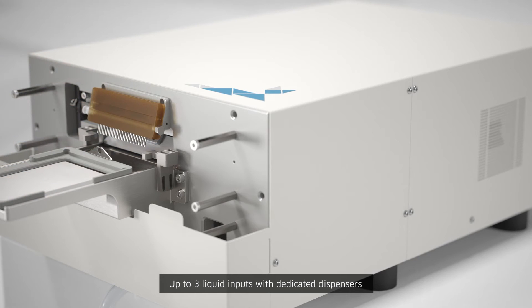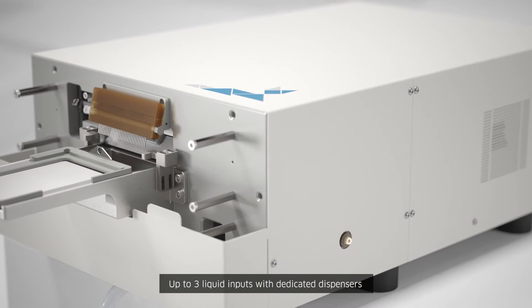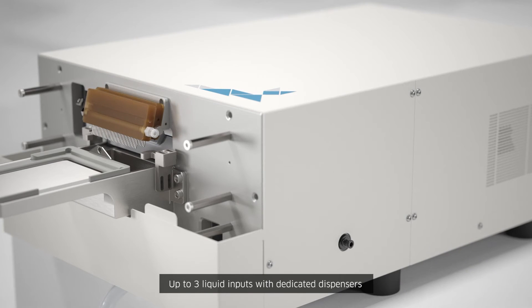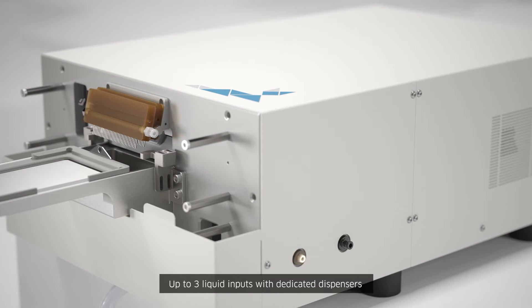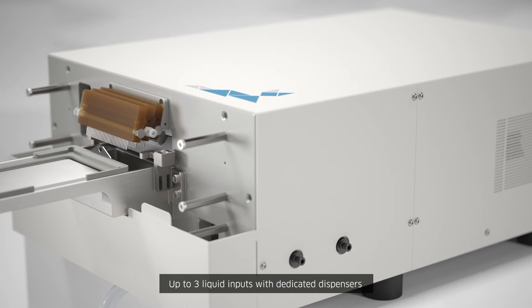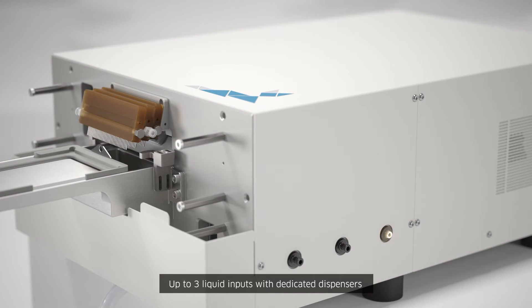In the advanced configuration, up to three dedicated liquid inputs can be added, each using a dedicated dispenser head, eliminating the need to purge a shared liquid path when switching liquids, making it economical to dispense precious reagents.